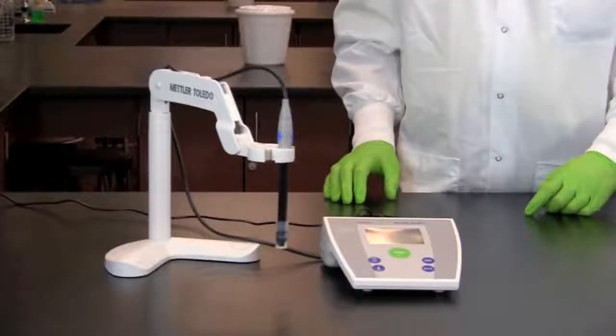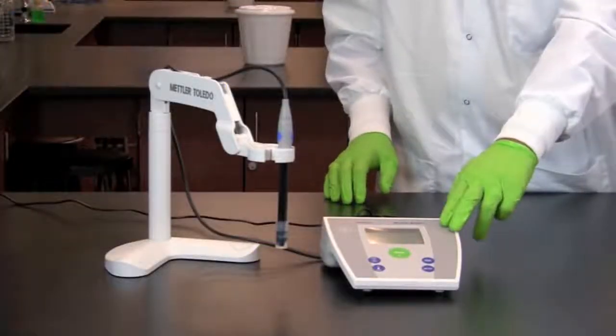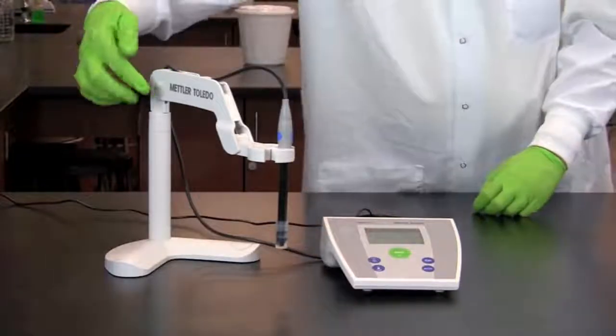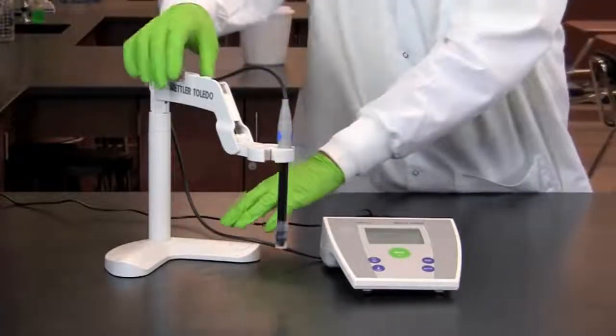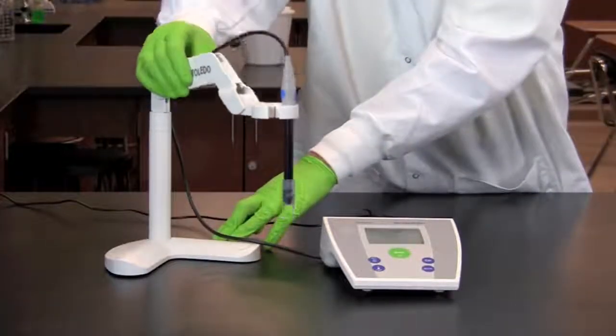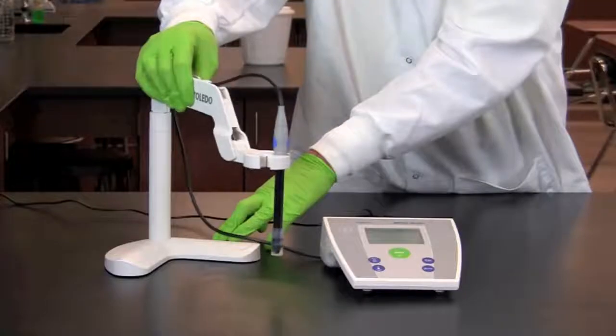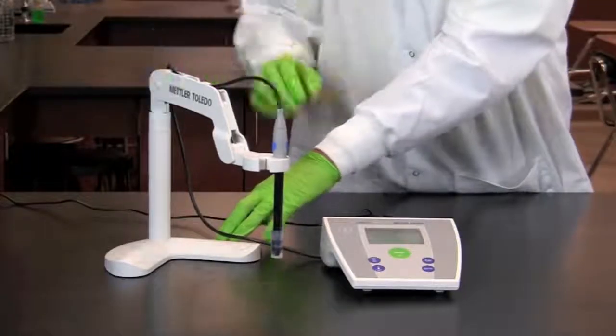The parts of a pH meter include the meter, the arm, and the electrode. The arm allows the electrode to be easily moved up and down into a beaker with a sample to be tested.